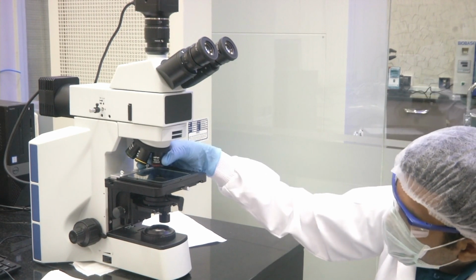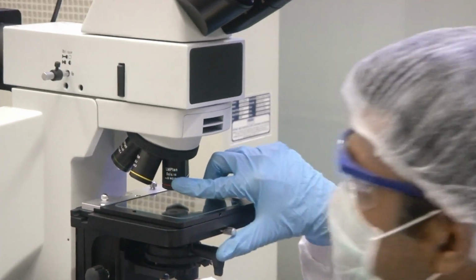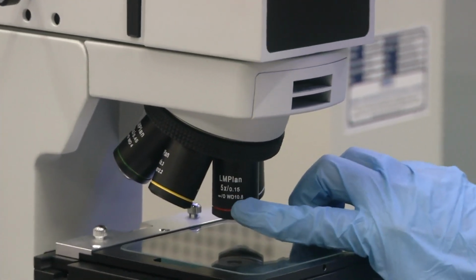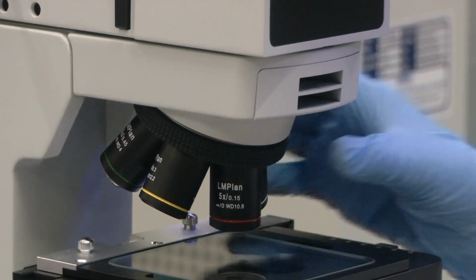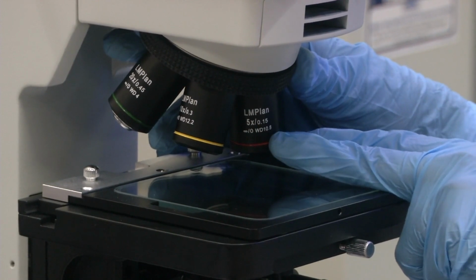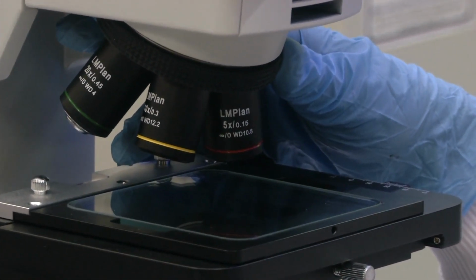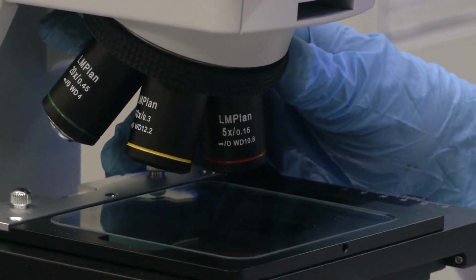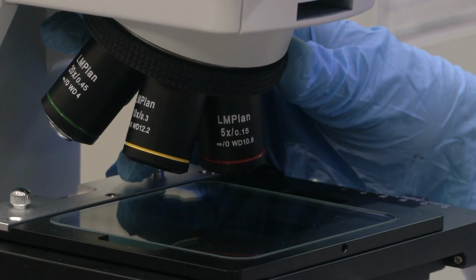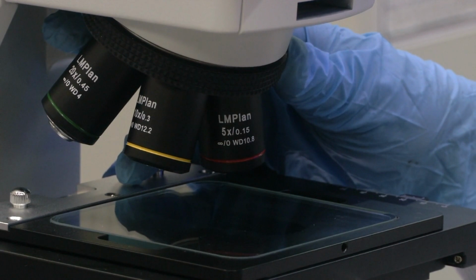If you look at the lens, you can see that it is written LM plan 5x slash 0.15 and WD 10.8. WD is called working distance. It is a measure of how close to the sample you can get, or how far away from the sample it is useful to use that lens. And 5x tells you the magnification that this lens can provide.